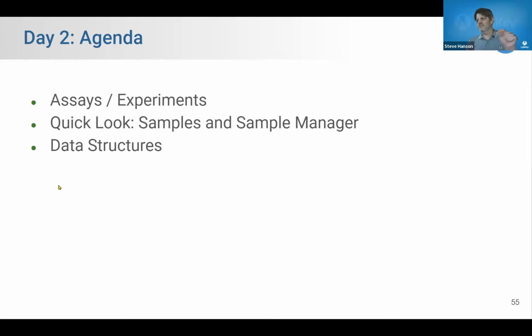I'm going to throw in a little cameo in the middle there. We're going to take a quick look at samples in Sample Manager. I know it's not really LabKey Server, but it is, and I want to emphasize that Sample Manager is part of every premium edition of LabKey. It's also available on its own, and it's based on LabKey Server. And it'd be kind of cool to see the relationship between them. And now that you're an admin, you're going to have to know how to serve up Sample Manager to somebody who wants it.